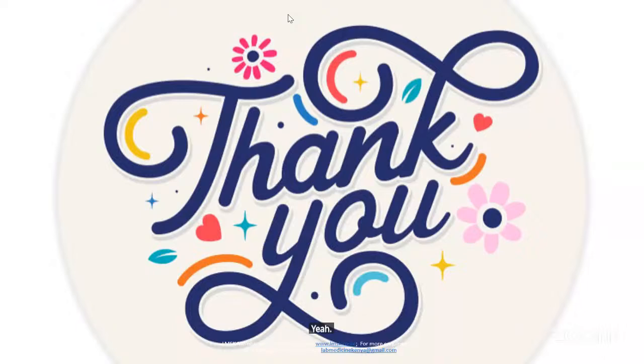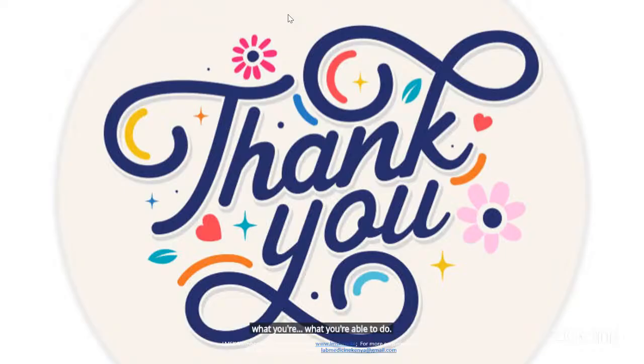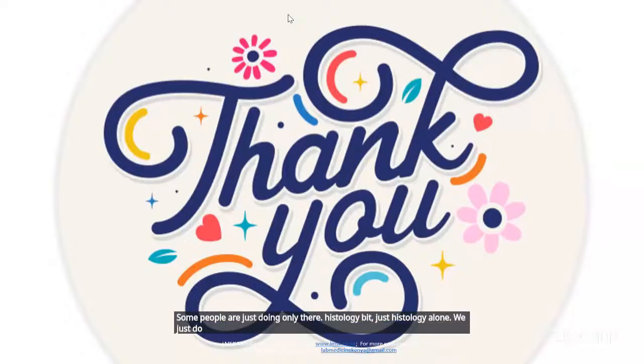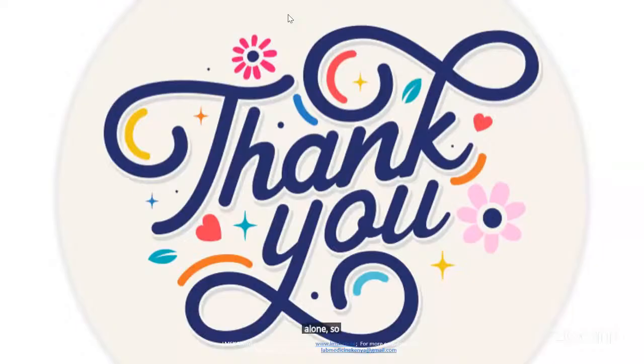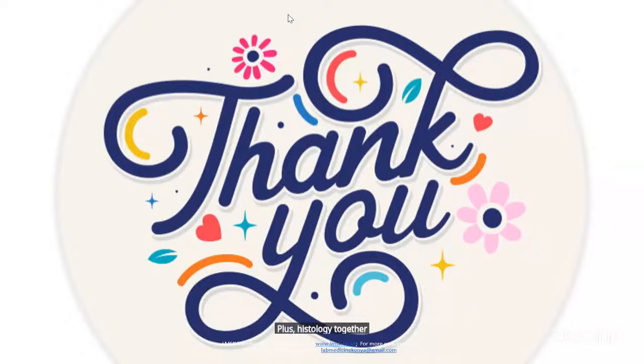Yeah, the cost. Every lab will have their own way of coming up with the cost, but in most cases, you'll have to see what is supposed to be done, what you're able to do. For instance, some people are doing only the histology bit, so their cost is just for histology. But in most labs, we are doing histology plus IHC. So you have to incorporate the cost of IHC plus histology together, then try to get a balance.